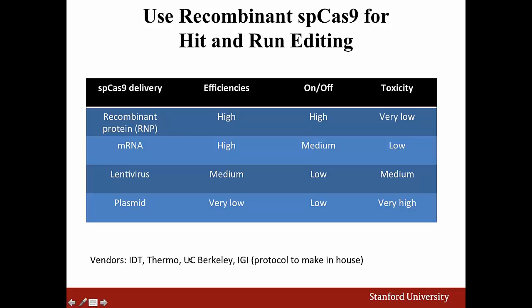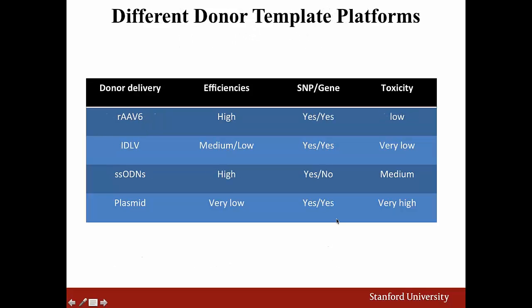We get it from IDT, Thermo. I know UC Berkeley is selling it, and I just saw Jacob Corn put a protocol online to make it in-house, which of course would be very cost effective.